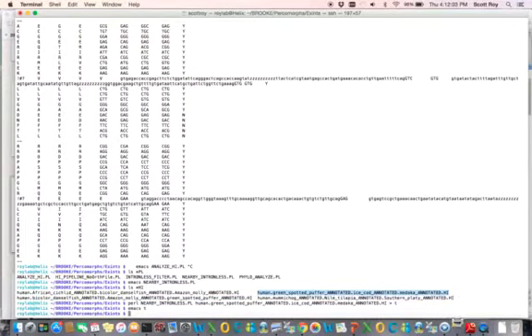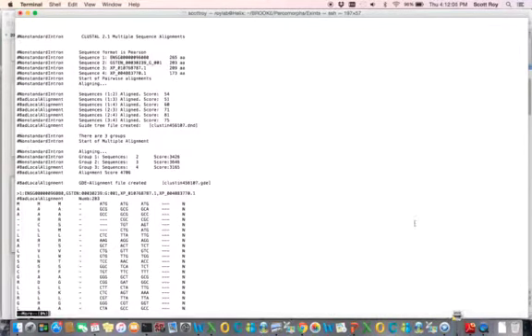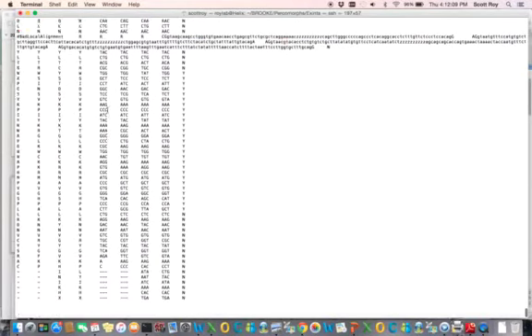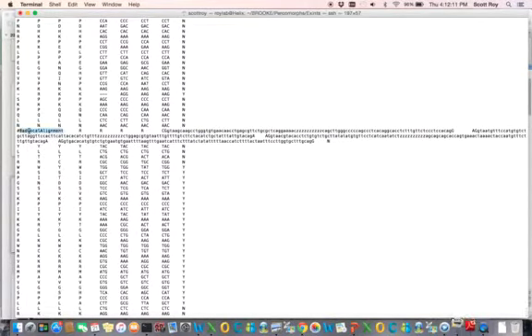Okay, so we're going to start with, this sort of overlaps the end of the last tutorial I made for you. We're going to start with the HI files, the raw HI files that look like this. And what you can see is that in the outputs, we already have some annotation of these things. So here's an intron position. As you see, it's actually conserved across all 4 species, but it does not have a good enough local alignment because of this gap nearby, this gapped position. And so it's been annotated as bad local alignment.